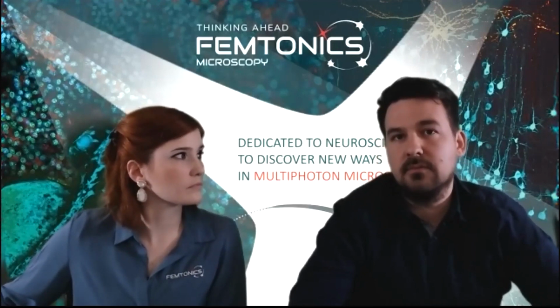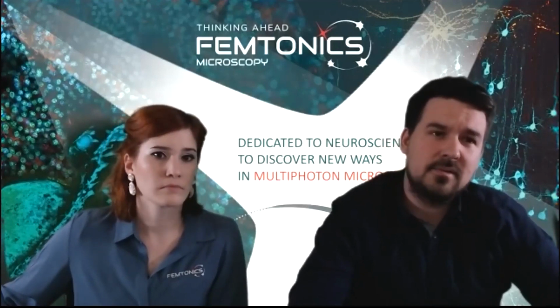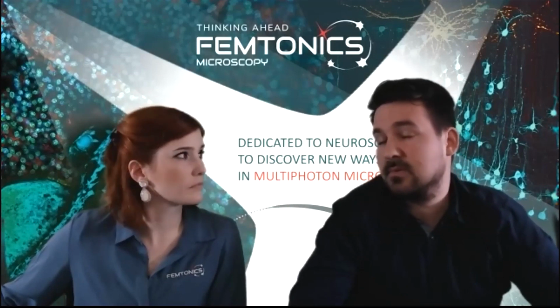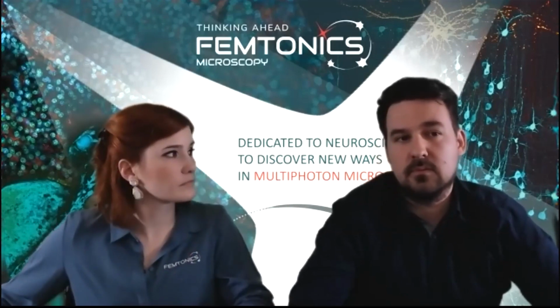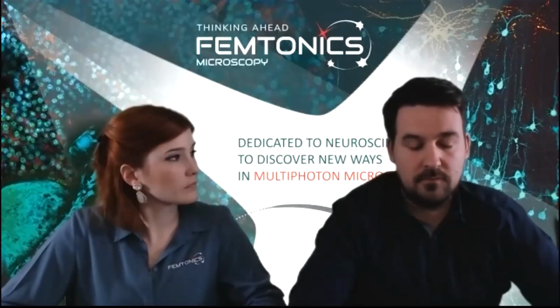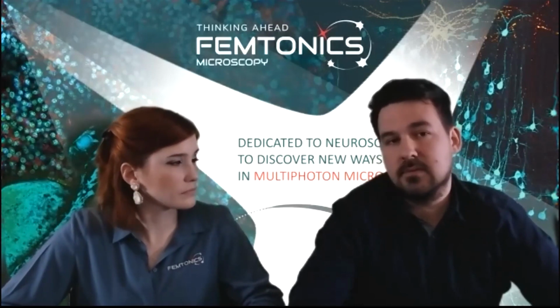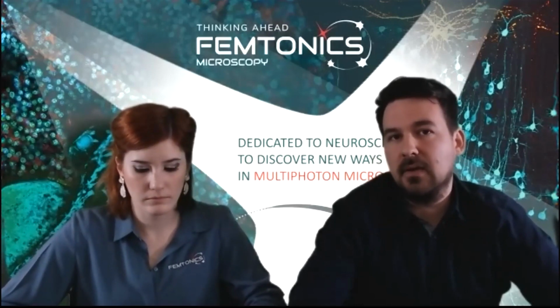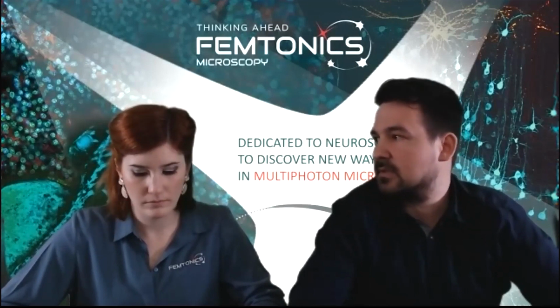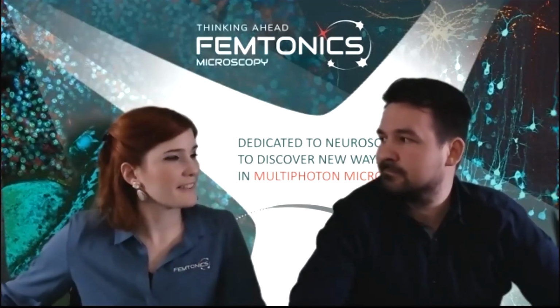There is a built-in function in the software for this reason. I also prefer some open source platforms, which could be very useful because our format, HDF5, is supported by many other platforms as well. So if you prefer other techniques, then you can use it. Thank you.